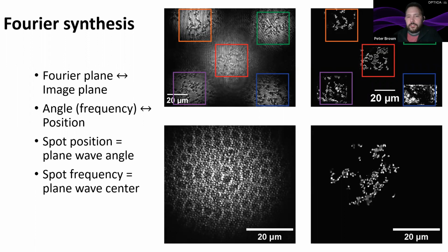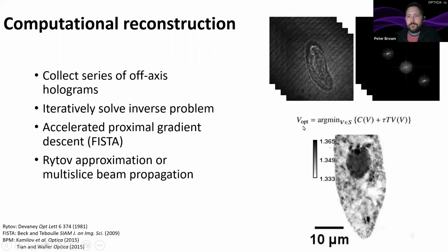We've tested these 2 approaches using our system, and we're able to produce nice position multiplexed images where we reconstructed several different fields of view. We should also be able to expand this multiplexing further to fill in some of the missing areas in this picture. And we've realized the angle multiplexing. Here I'm showing you an example where we've multiplexed 12 plane waves in a single image, and get a reasonable reconstruction.